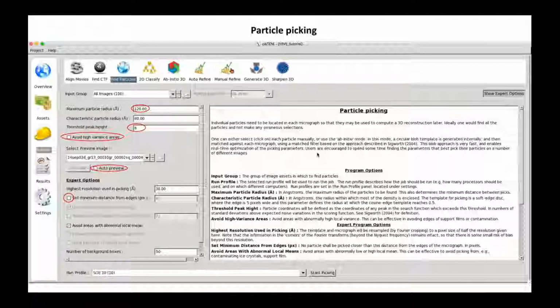It sometimes doesn't explain detailed things, but it's very useful for you to change or choose values for the parameters for your processing. So I added a red circle to the most important things that you should be able to play with and see differences in your result.